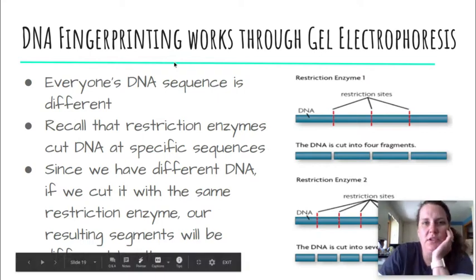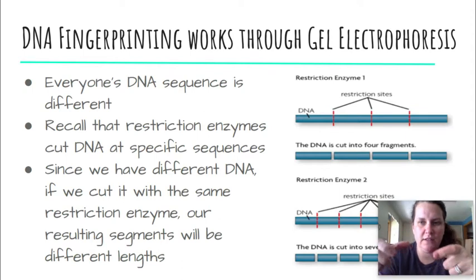So when you look at this word, gel electrophoresis, gel literally is going to refer to a gel. It's kind of like a jello. It's not jello. It's an agarose gel that is used. It's a little bit firmer than jello, but it's a gel. And then electrophoresis. If we were all together in the classroom, I would say, okay, what does this word remind you of? Or what do you see in it? Yep, you see electricity. So they take electricity and apply it to this gel that has DNA in it.